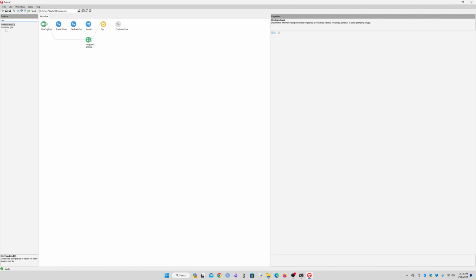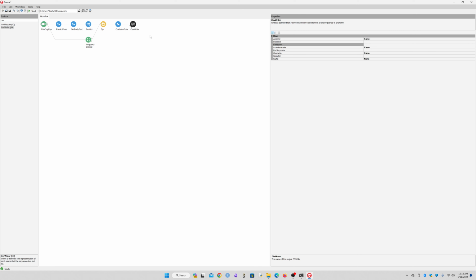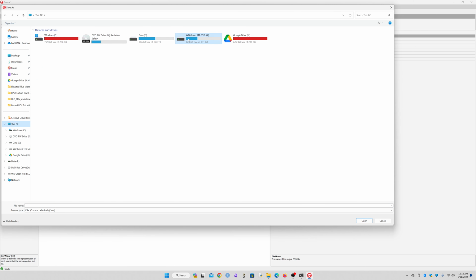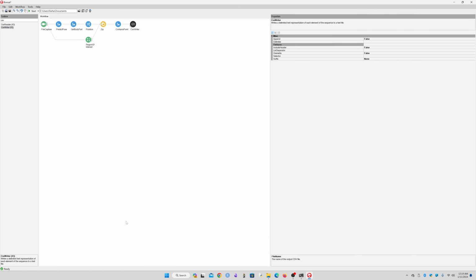And let me actually demo this so we get some idea of what's going on. I'll go ahead and save this in the same folder and call it CSV out test. Give it a header and overwrite it, and I'm just going to let this analysis run, and then go and take a look at the CSV with you guys and show you how we can calculate the total time that the mouse is spending inside of that ROI.